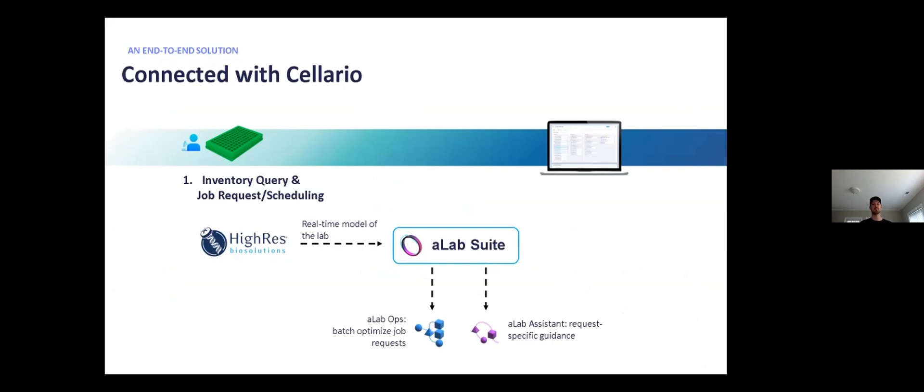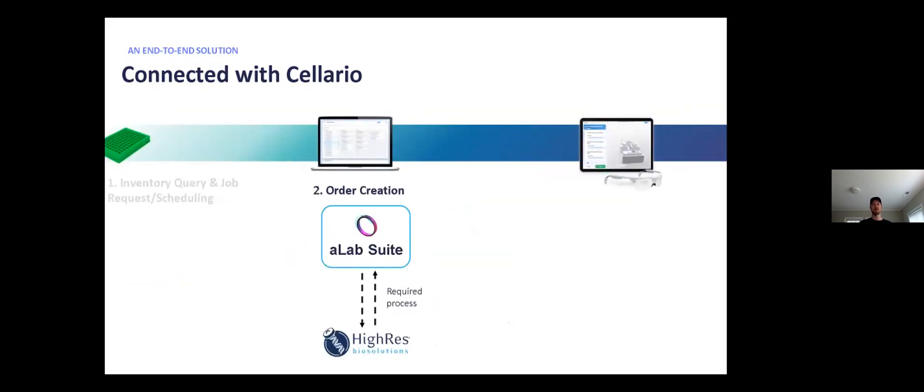Once the state of the system is known, we can determine where the plates will be loaded based on the requested protocol and the existing inventory and then kick off an A-Lab assistant to guide the user with the digital twin in order to set up the work cell correctly for the job. So loading in the plates, adding the reagents, etc.